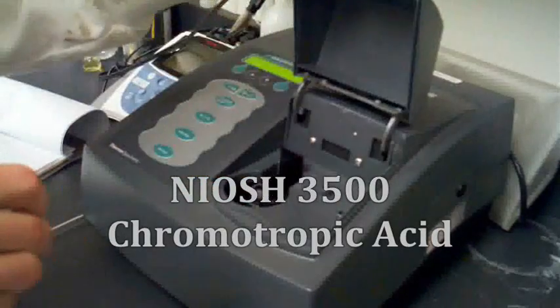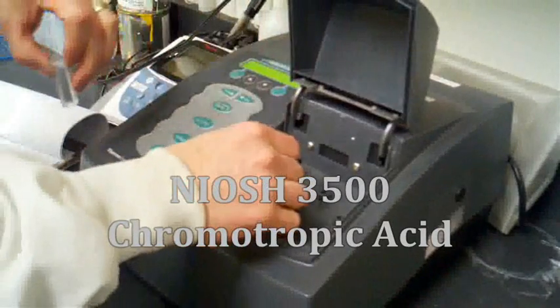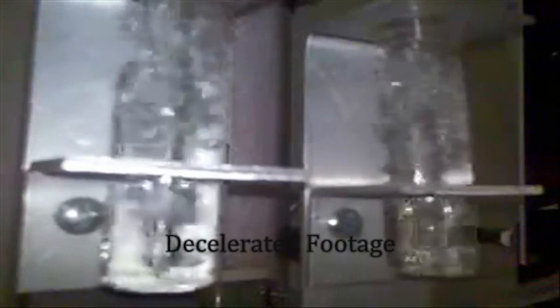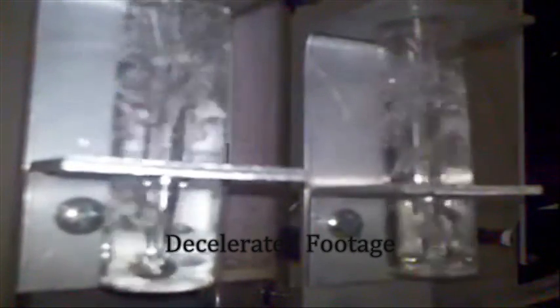The large chamber test requires that the samples remain in the chamber for 16 to 20 hours before taking an air sample to determine the formaldehyde concentration in the air. The analytical method specified by this test method is a slightly modified version of the NIOSH 3500 method where air is bubbled through an impinger containing a 1% sodium bisulfite solution.